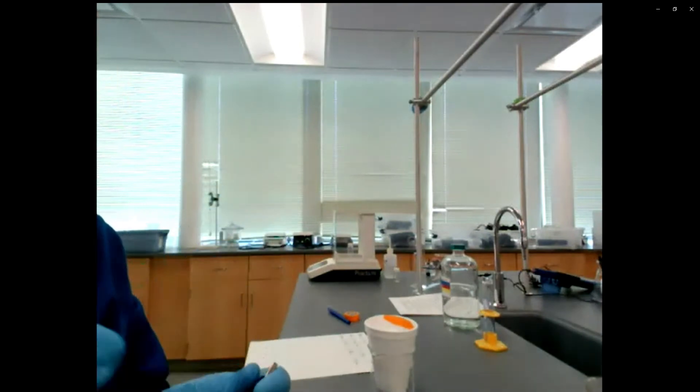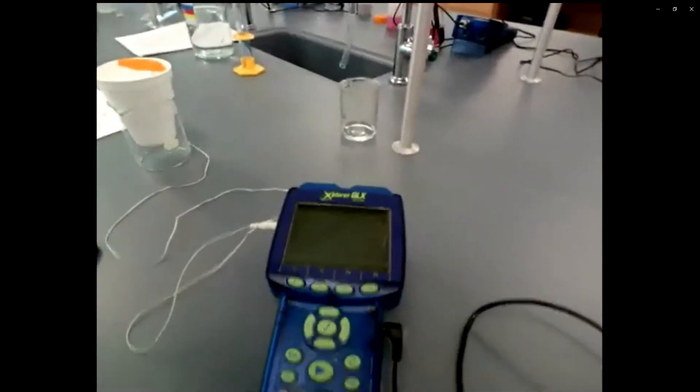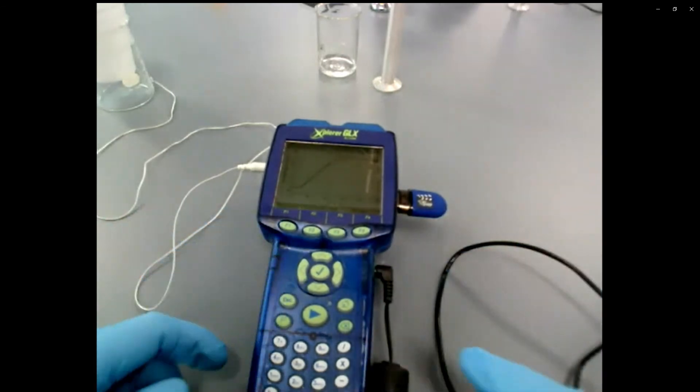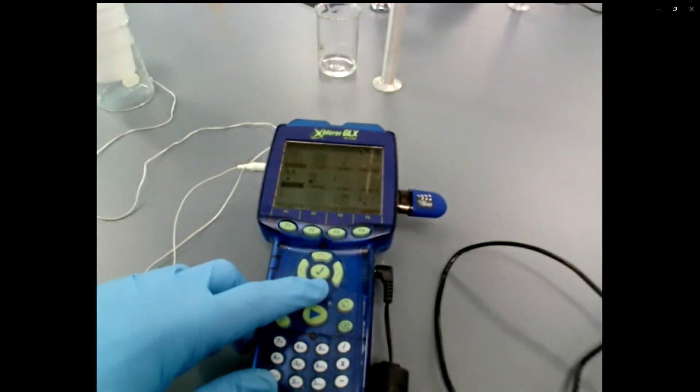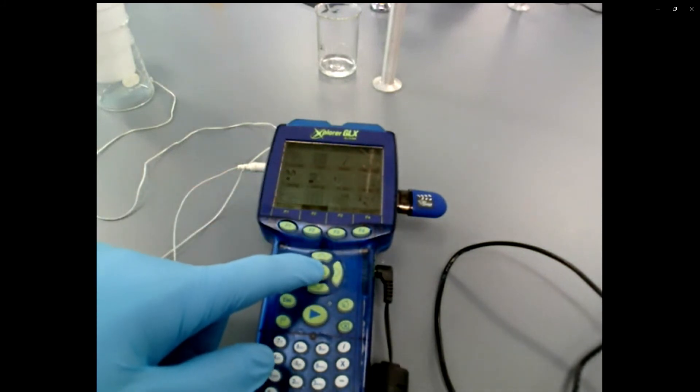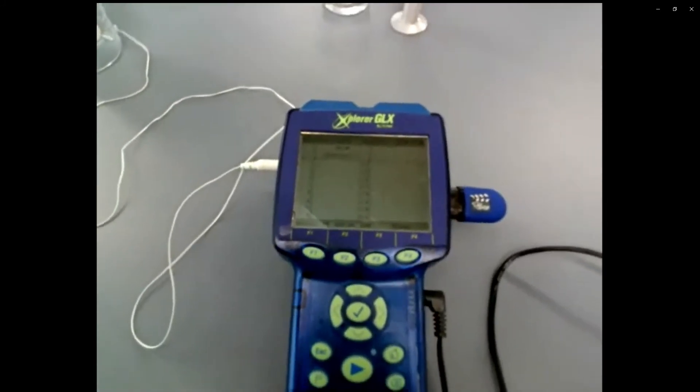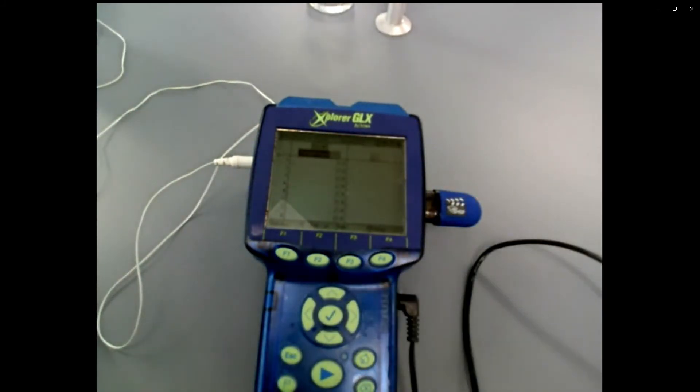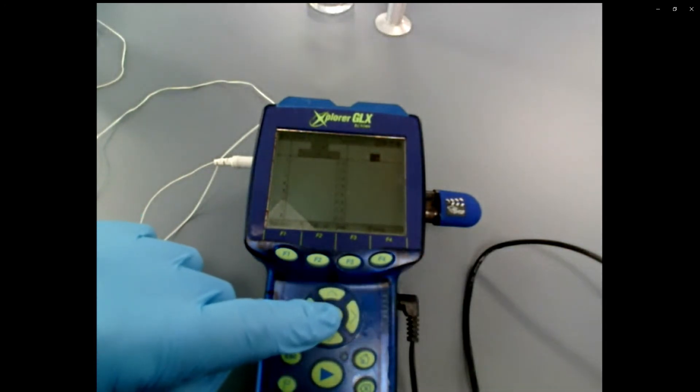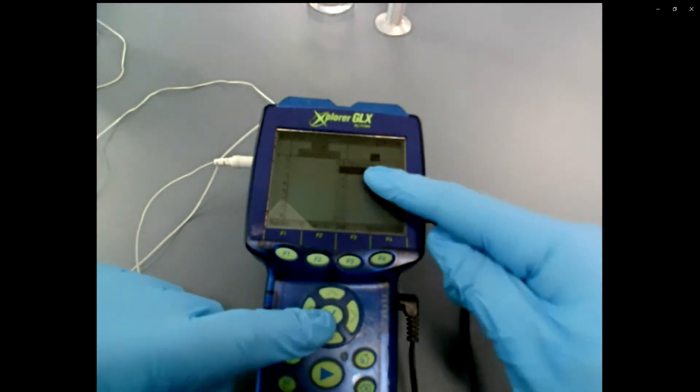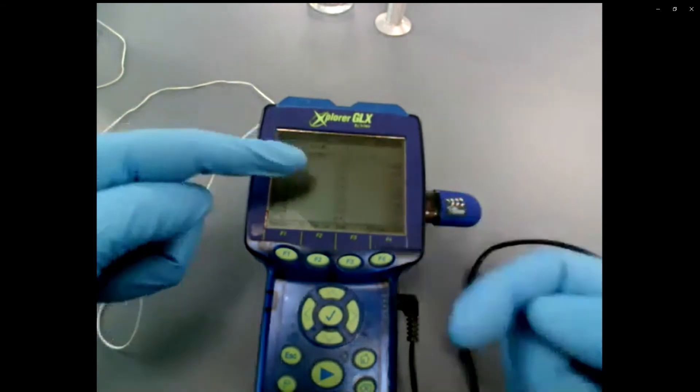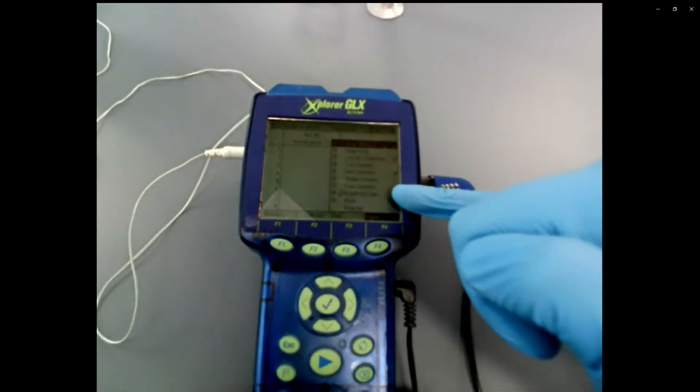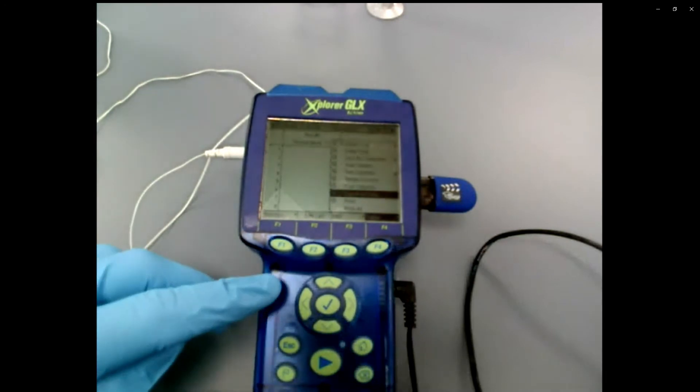So like I said, we've got to get the data off this thing. So I got a flash drive, USB stick, thumb drive, whatever you want to call it, goes on the side. So if you have one of these, bring it to lab, preferably if you have a small one. The memory on these devices is kind of not the grandest and it can struggle processing larger thumb drives. So I've gone to the table view and this is blurry, but it says run one and it has temperature data and I need the time data to show up on the right. So I'm going to hit check. Then I'm going to scroll over to the right column, hit check again. And one of the options is time. So I'm going to select that by hitting check again. So now I've got the temperature data displayed and the time data displayed, and I'm ready to pull the data off of this thing. So I'm going to hit F4 and then scroll down to a selection that says export all data.